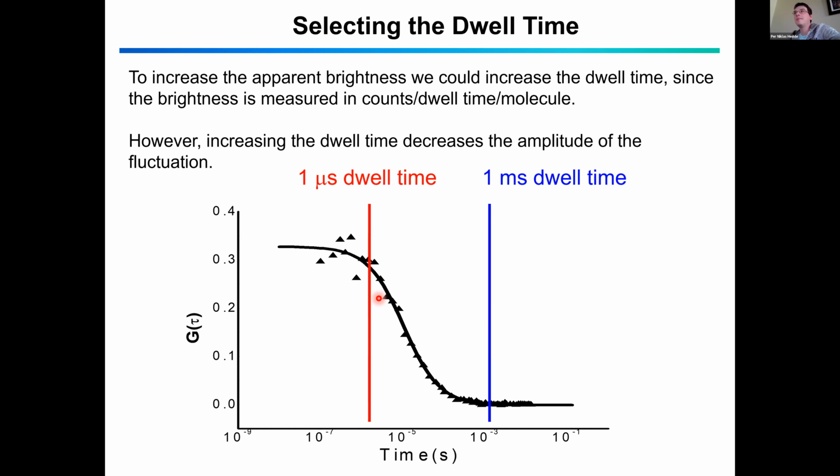However, it can become a problem with camera-based systems, because now with cameras, you acquire the full image in one shot, but then you expose all the pixels for a longer time, maybe 10 milliseconds or even 100 milliseconds. So in this time, the molecules had plenty of time, for example, if they are moving fast in the cytosol, to move around and then average out your signal fluctuations. So in the camera-based systems, to overcome this problem, what you can do is, for example, use stroboscopic illumination. So you just flash the sample very fast, excite only for a period of, let's say, 100 microseconds or so, which is faster than the molecules can move between pixels, to not get this kind of motion blur.